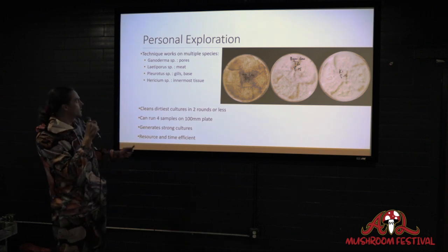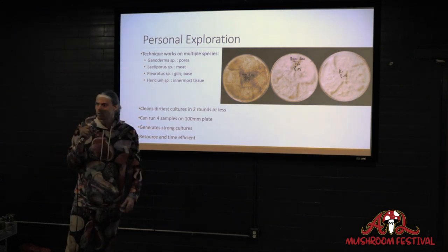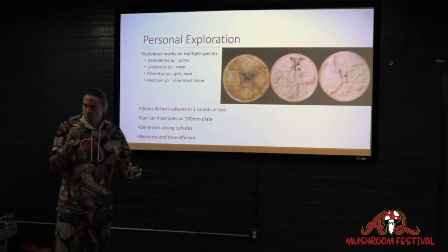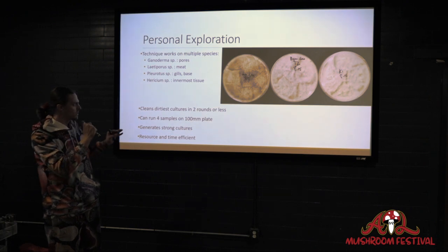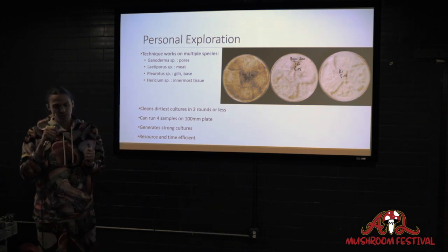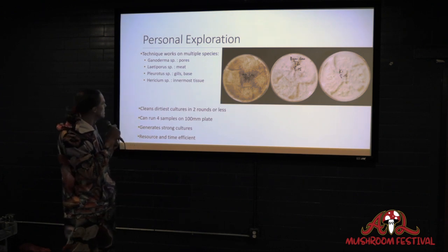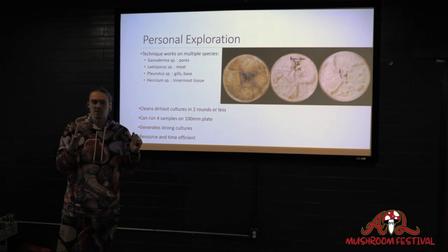For me, I found that with Ganoderma, I get really good cultures from the pores. I've tried to take inner meat selections like you would with most mushrooms and not found a lot of success, but the pores tend to push out really good, strong, healthy mycelia. For chicken of the woods, I've found that the pores often contaminate, but if I go to the center near the base of the mushroom, I can get cultures started from there pretty easily. For oyster mushrooms, wherever you can pull off a piece of mycelia, it'll grow.